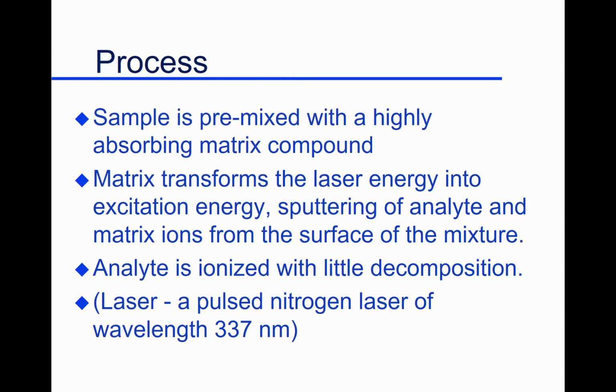So what is MALDI? The sample is premixed with a highly absorbing compound, meaning it absorbs laser energy. And so you mix your sample, whatever it is that you want to analyze, with an energy absorbing matrix. You put the matrix onto a nice little dot. You put the dot into this holder, and you zap it with a laser beam. And that laser beam, 337 nanometers, nitrogen laser, basically explodes it.